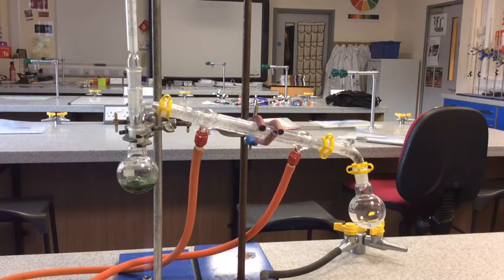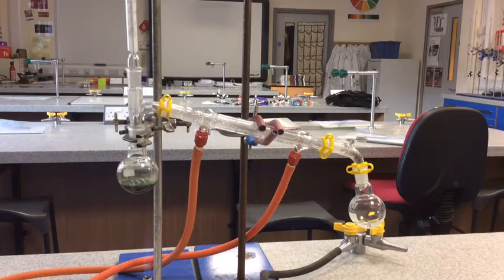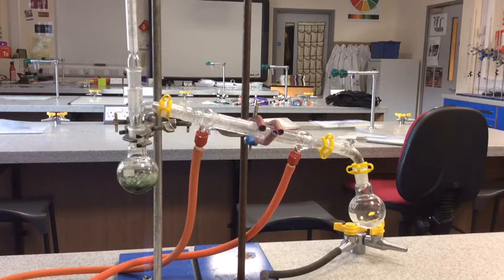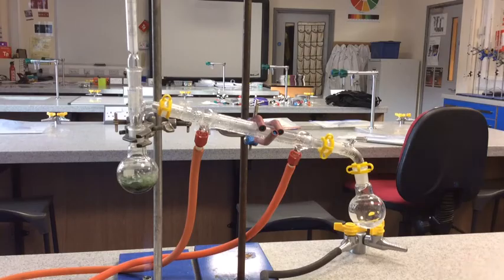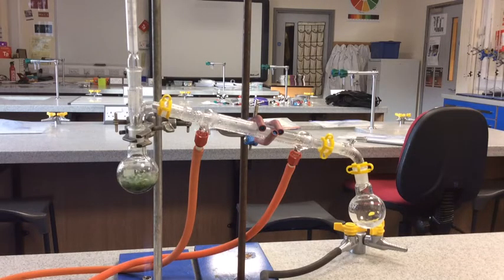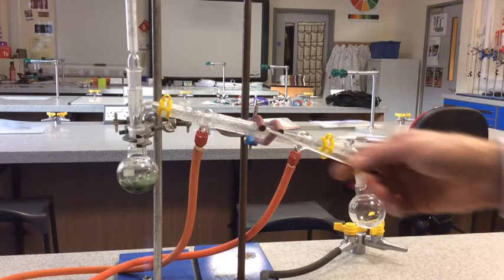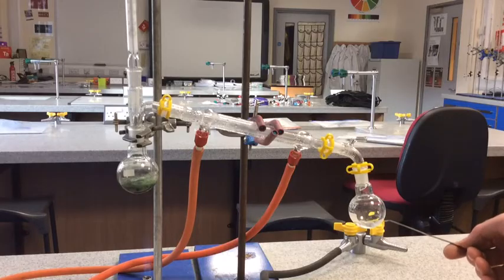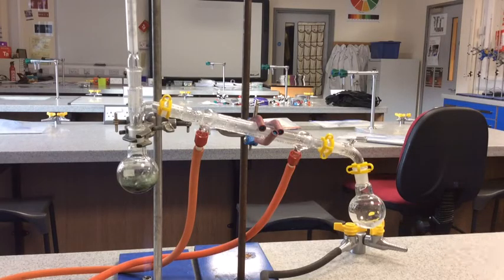With distillation apparatus, there's only one oxidation taking place, and so we don't get the carboxylic acid formed because the aldehyde is taken out of the reaction because of the position of the condenser. So what should be in here is aldehyde. Now because this has been formed by a process called distillation, the technical term for the liquid inside this flask is the distillate.